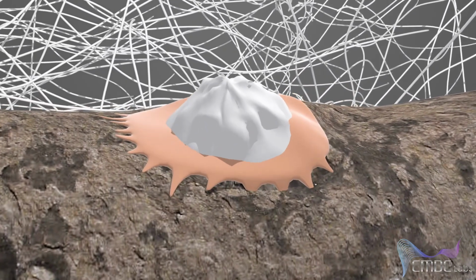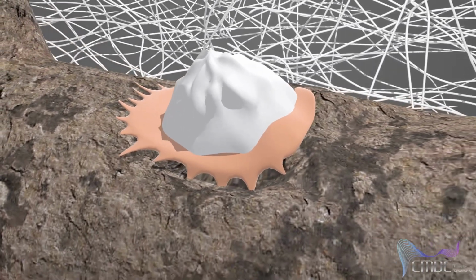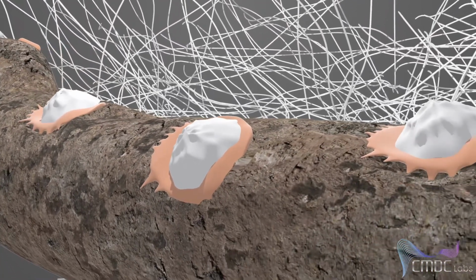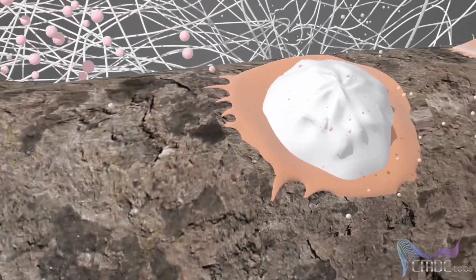To initiate the proliferative phase, fibroblasts are introduced into the CT chamber 3 to 4 days after injury. Migration of fibroblasts and their ability to synthesize components such as collagen, elastin, and proteoglycans that are used to protect and stabilize the extracellular matrix are evaluated for granulation tissue formation.